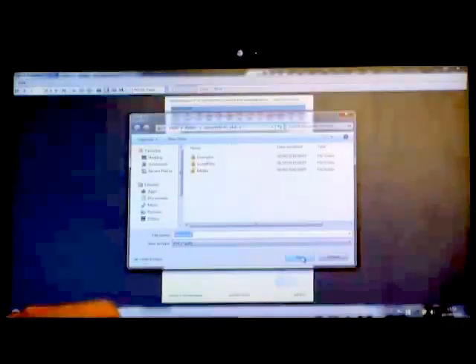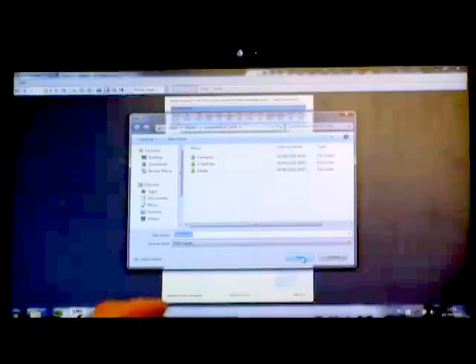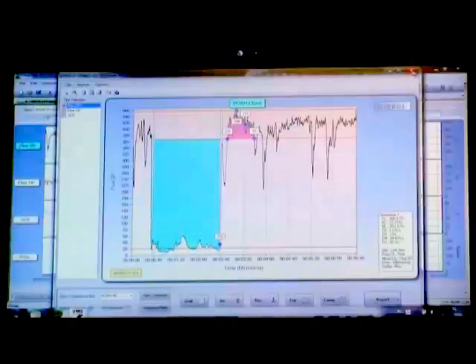Once you've captured all this data within a report, you can export the data to Excel, to a PDF document, or to a Word document, which we'll do right now. So we'll just click to export. We'll save this data as PDF because that's how we require to save it this time, and then save the report.pdf to the data folder we have already set up. I'm now going to close the report window and close the analysis.